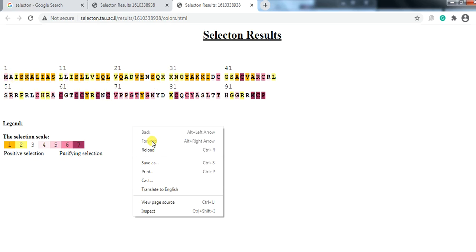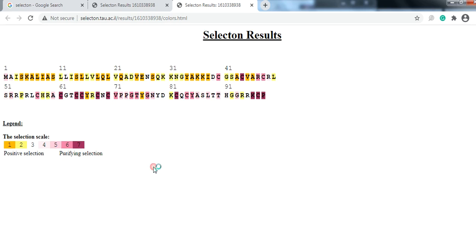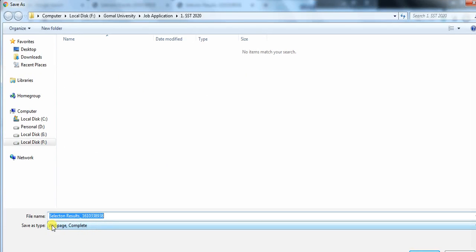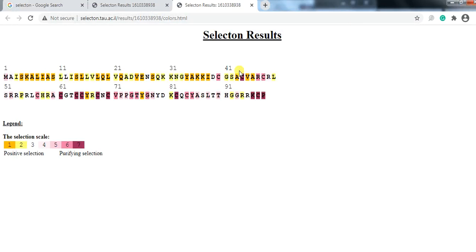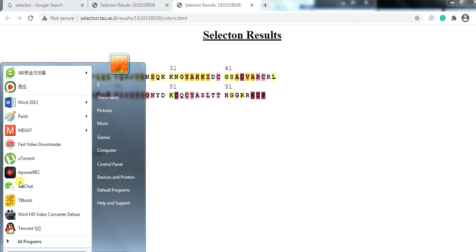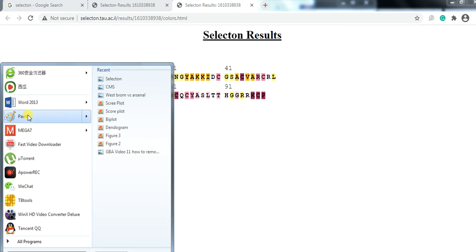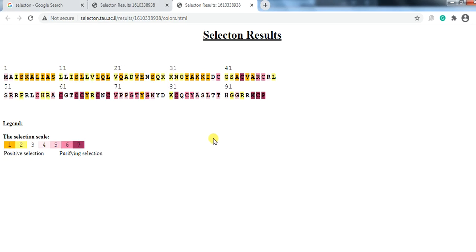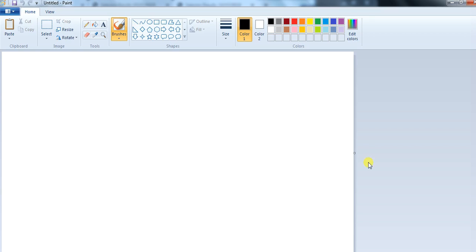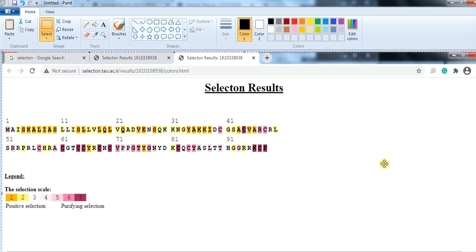To save the result, if you right-click and try to save it, you can see it is not saved in picture form. So to save it as a picture, you need to press the Print Screen button on your keyboard, then open Paint or any other image tool, and paste it there.